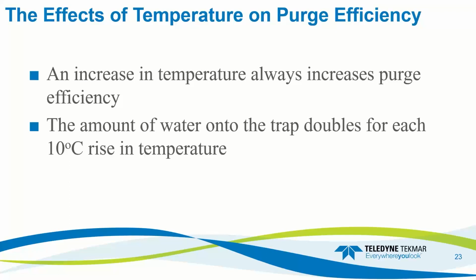The amount of water vapor that makes it onto the trap doubles for each 10 degrees C rise in sample purge temperature. So we will be adding a little bit more water vapor onto that trap if we raise the sample purge temperature.